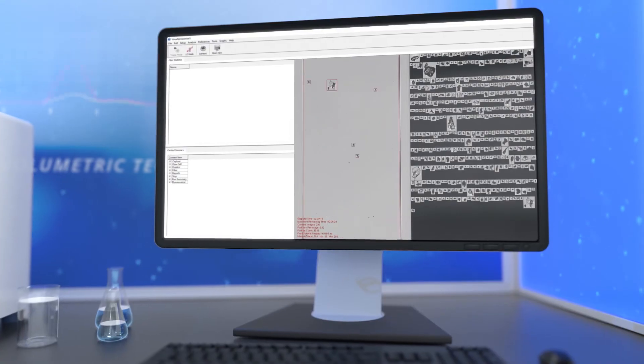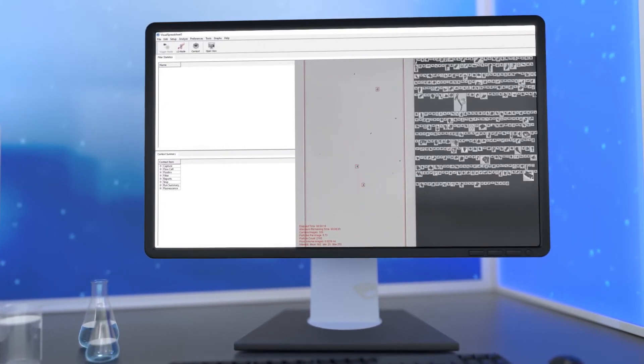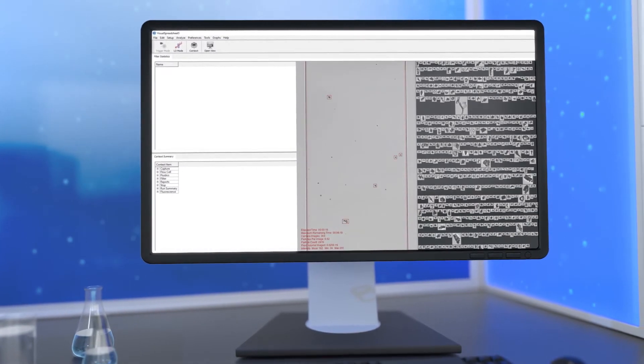In real-time, the FlowCam software, visual spreadsheet, automatically separates and organizes the images of each particle.